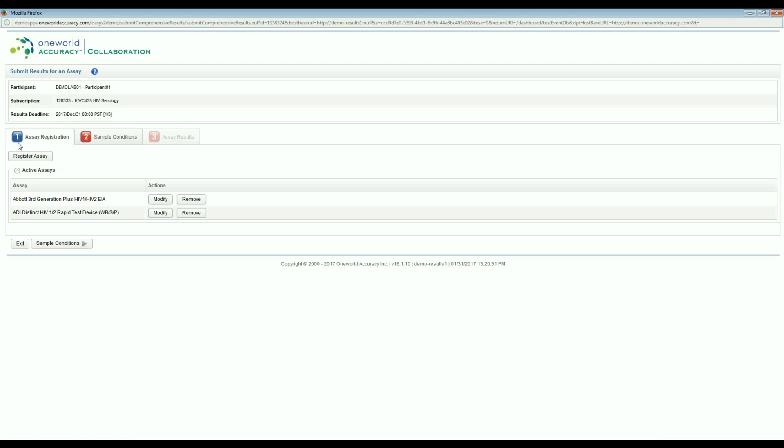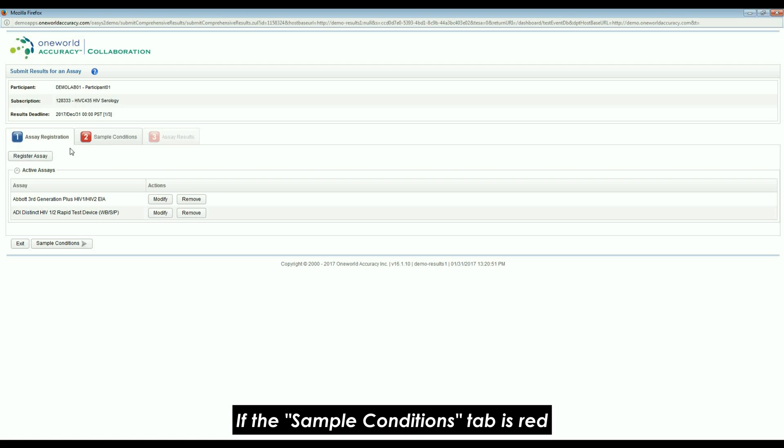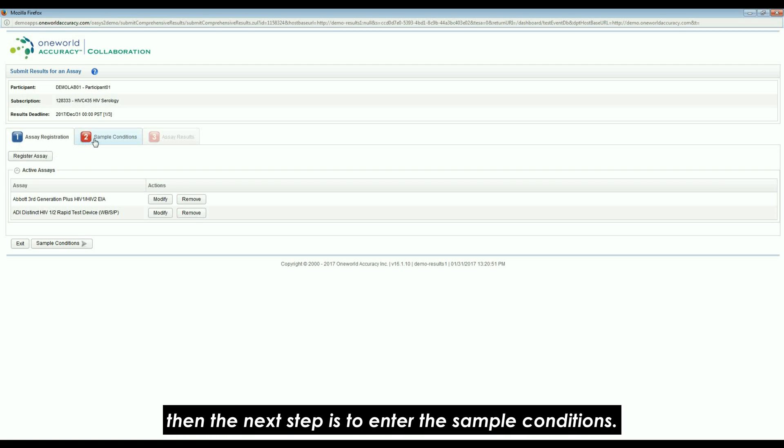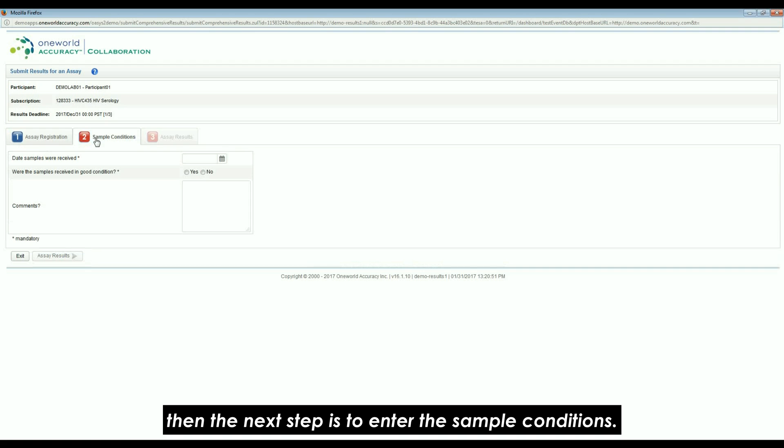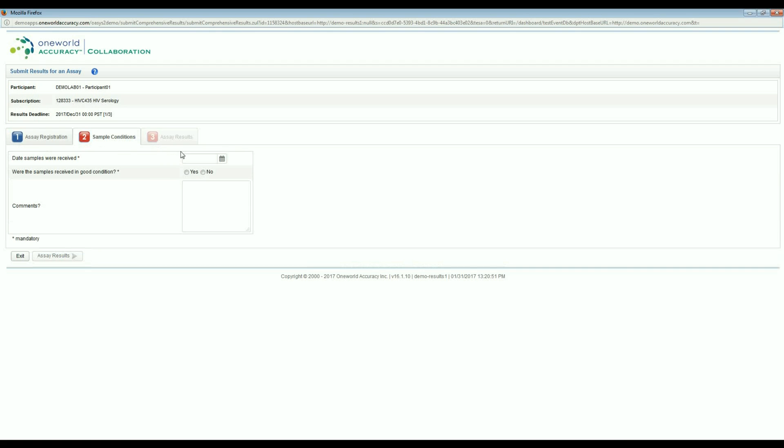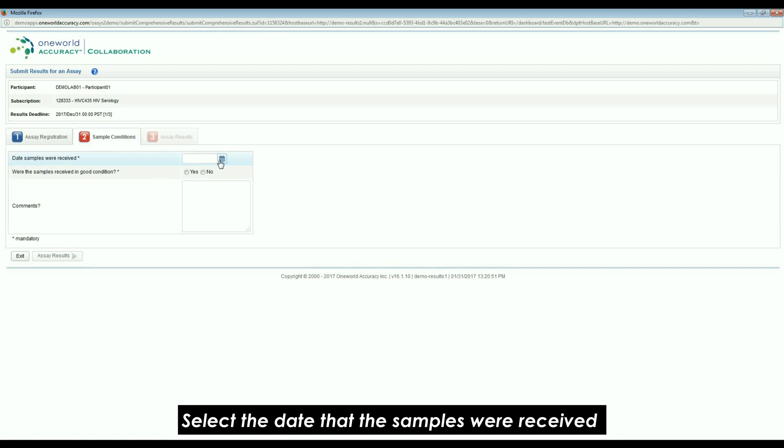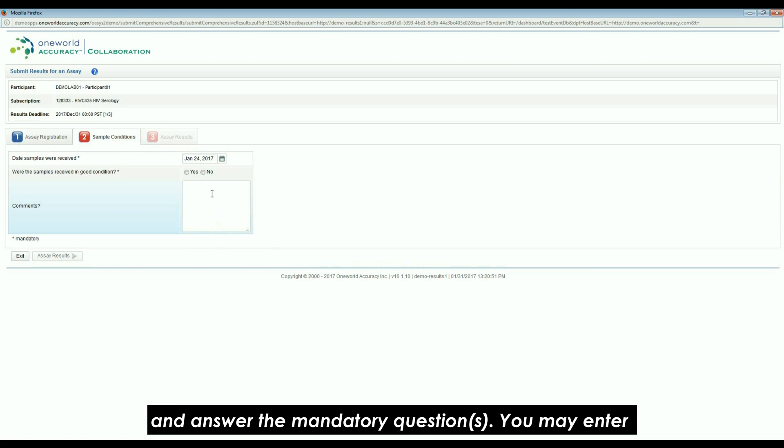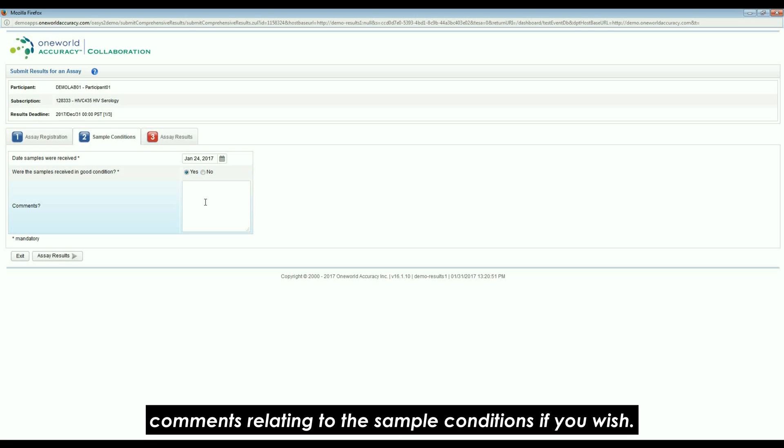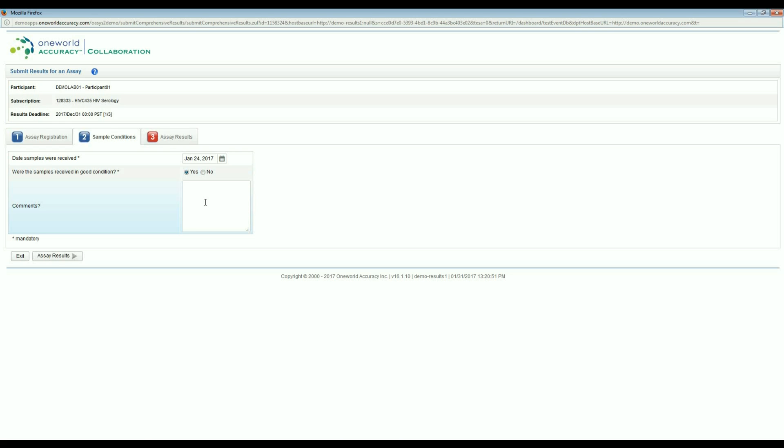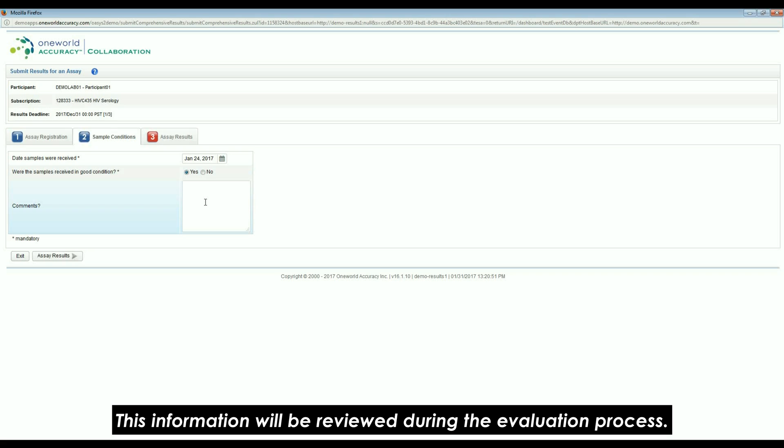If the Sample Conditions tab is red, then the next step is to enter the sample conditions. Select the date that the samples were received and answer the mandatory questions. You may enter comments relating to the sample conditions if you wish. This information will be reviewed during the evaluation process.